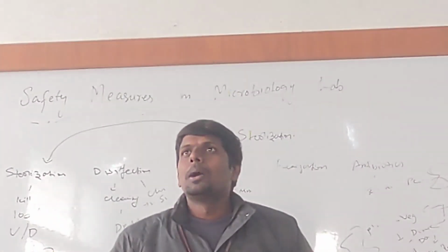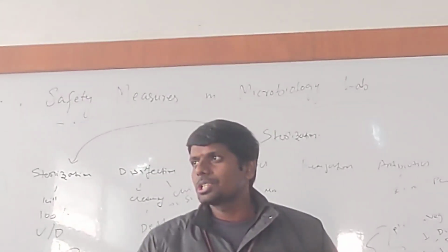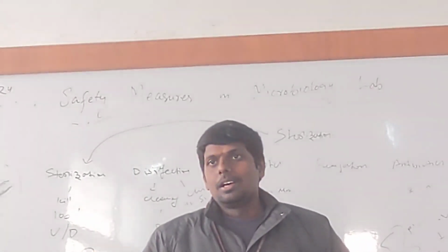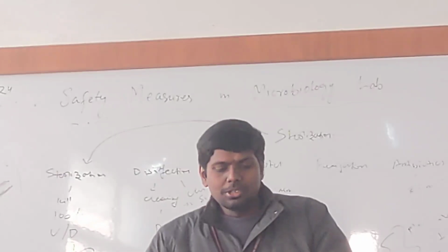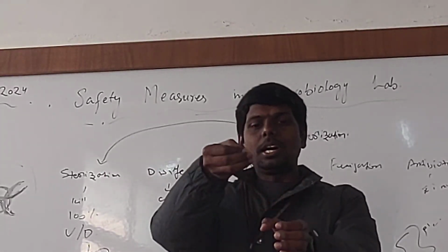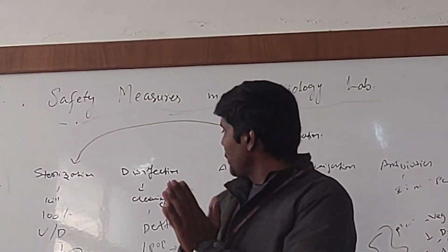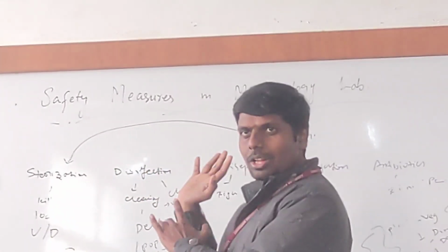Okay. There is one more technique called inspissation. What is inspissation? Any idea? Similarly, we will keep the sample on a vapor for half an hour. That is inspissation. I hope you got some idea about the sterilization and all these things, right?